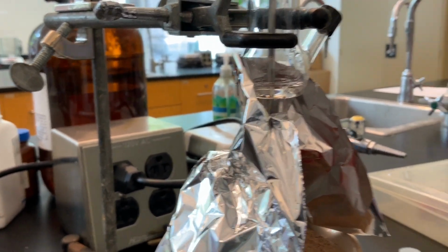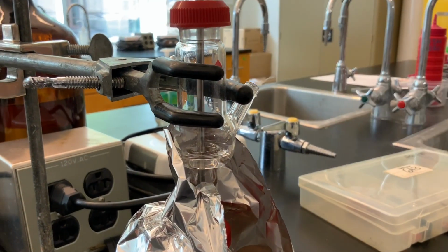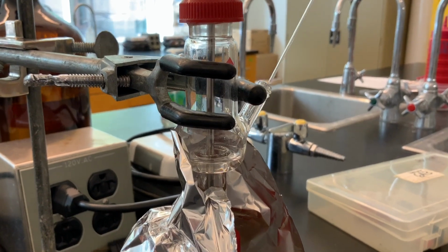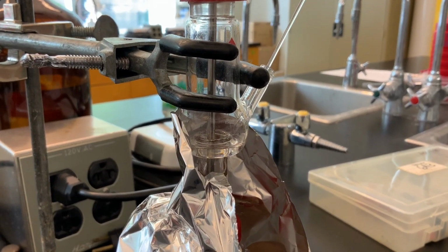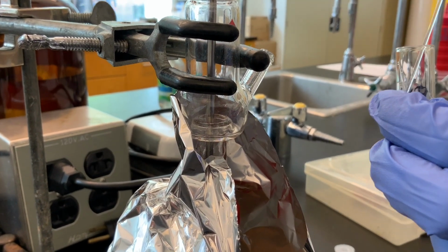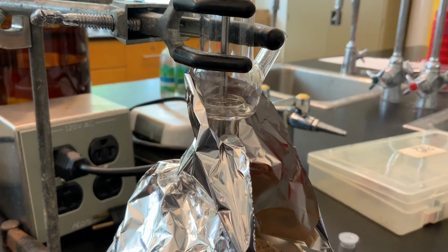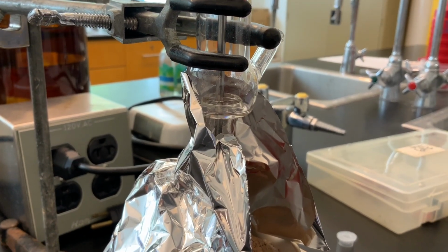And I, of course, have a new Pasteur pipette. Unscrewing the side arm of the still head. You can even see the vapors start to come out of the area. This fraction is much hotter, which makes sense. It's higher boiling solvent.